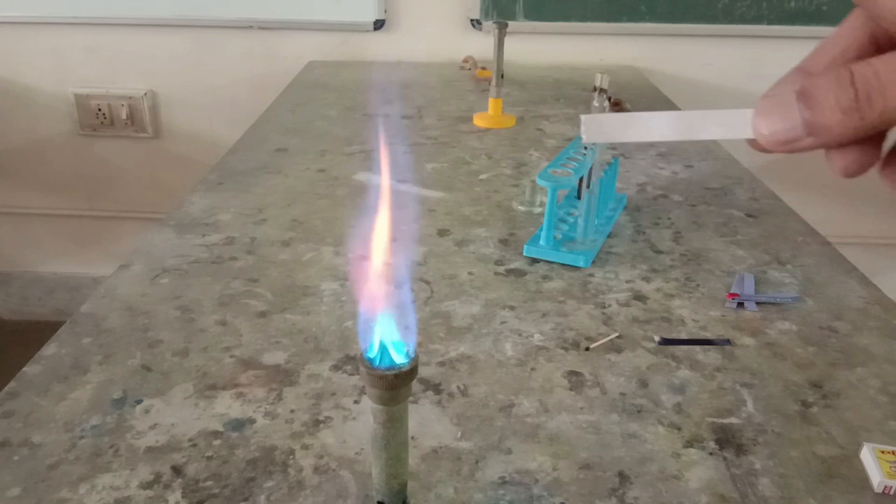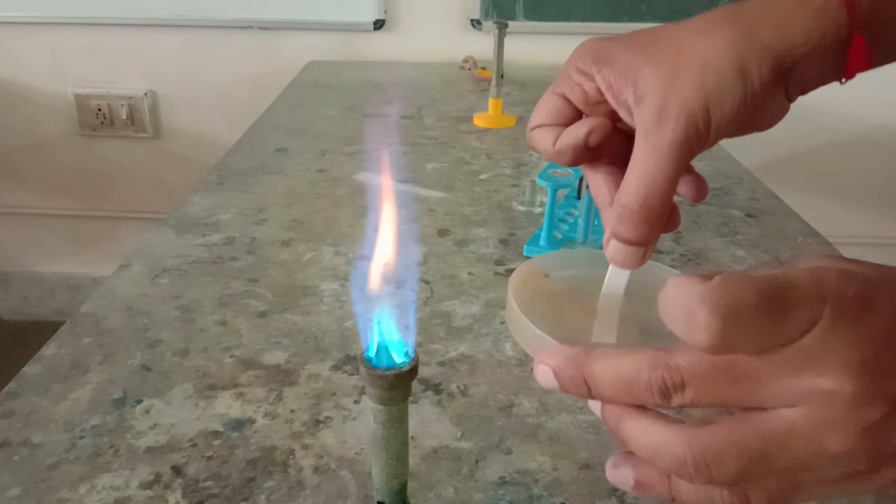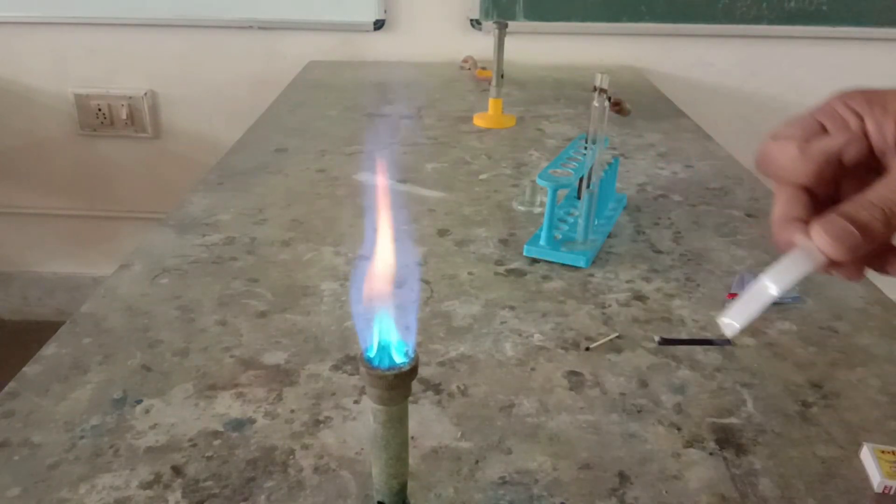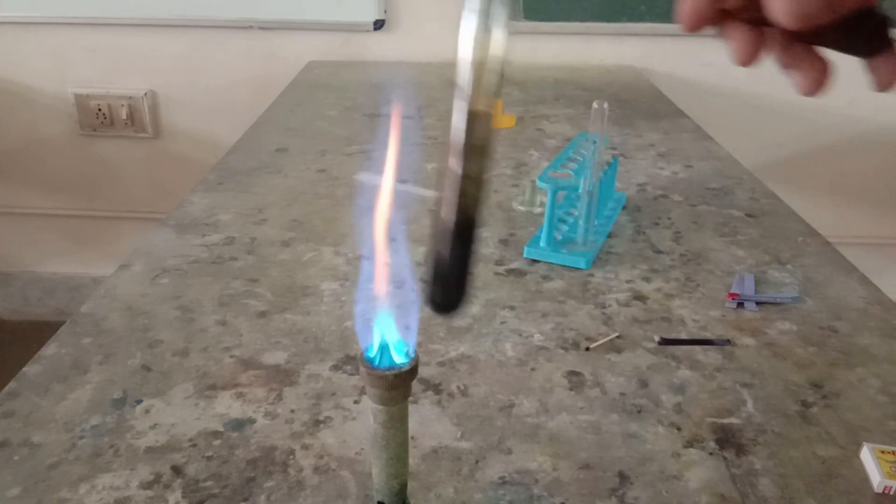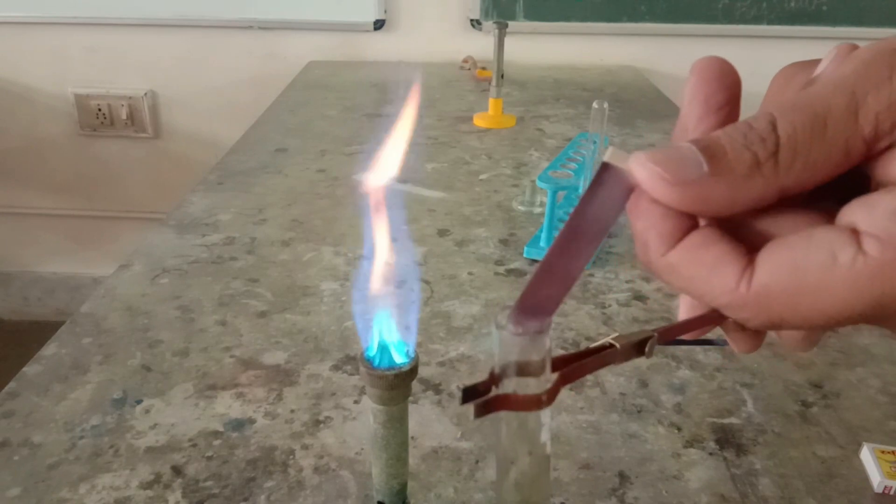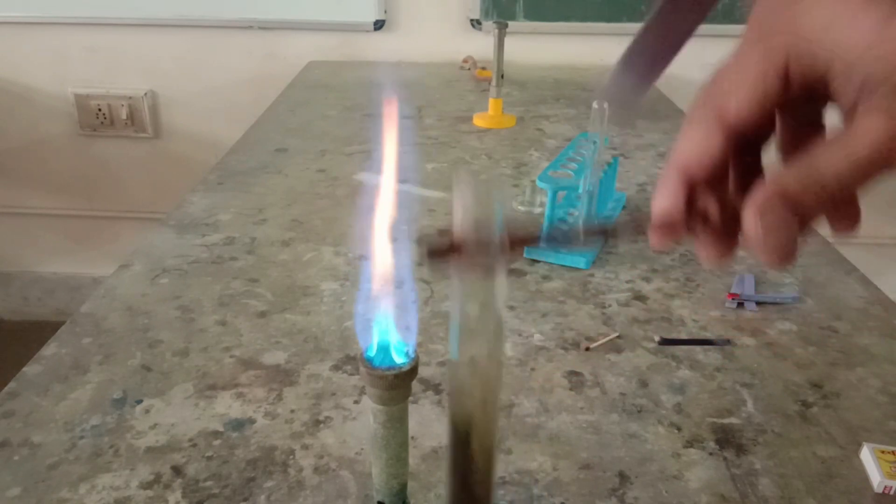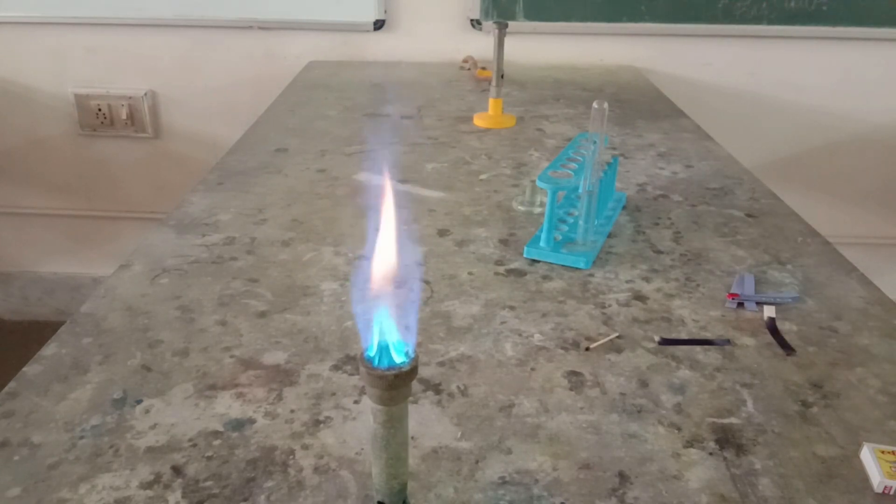This is a white colored starch iodide paper. I'm going to gently dip it into the distilled water and put it over the mouth of the test tube. Now chlorine gas immediately converts this starch iodide paper black in color. This is the confirmatory test for chlorine gas.